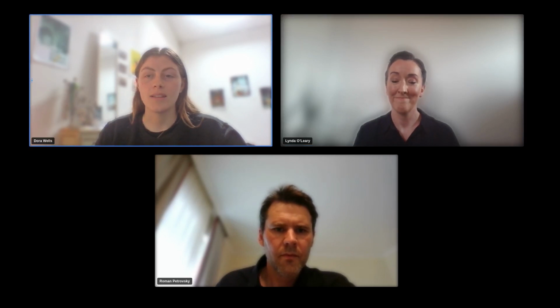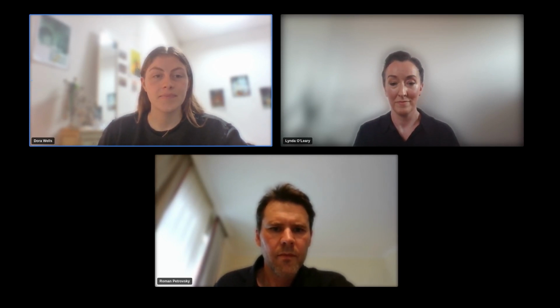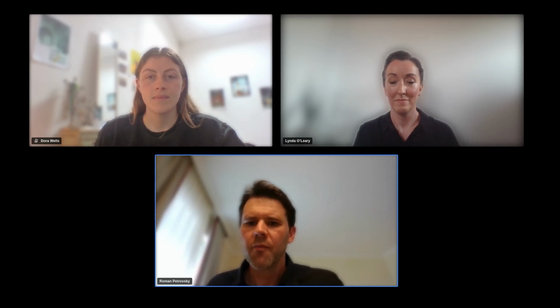Excellent. Thanks a lot for that one. So the next question I've got here from an attendee is, can I use an existing Spark Cyto with the new 3D features? Maybe Roman, this is a question for you. Yeah. Seems to be lagging a bit, but I'll try. So you can upgrade existing Spark Cytos. That's not a problem. For the details, I would advise contacting our sales representative. Then we can clarify that. But the option exists. Great. Thanks a lot for that one. Yes, I can see your video is lagging slightly behind your audio, but your audio is coming through completely clearly.